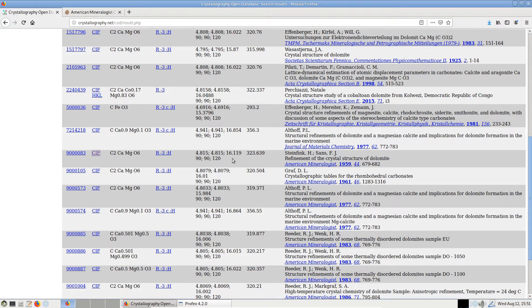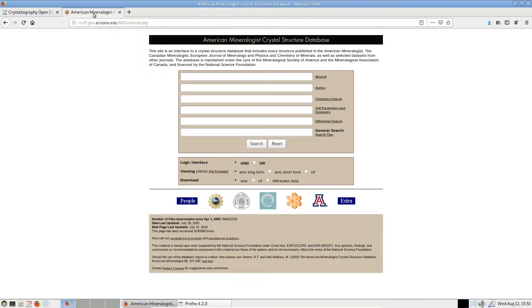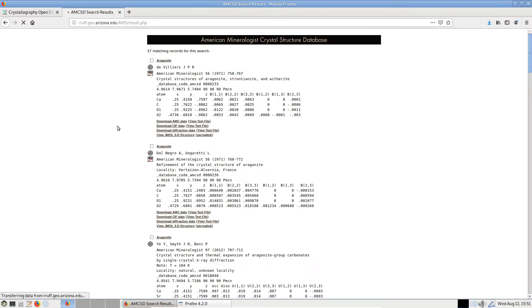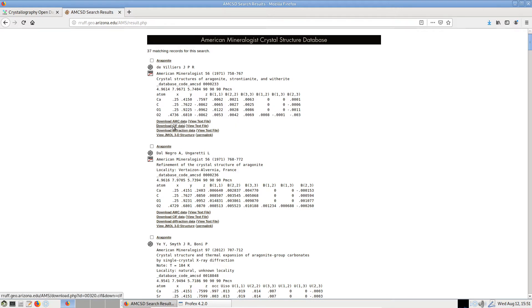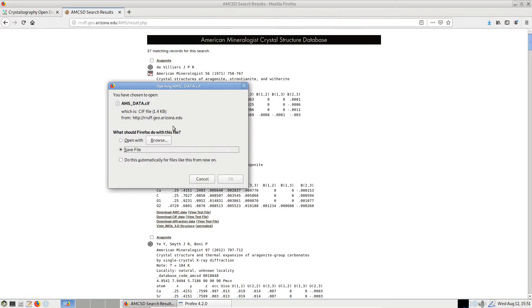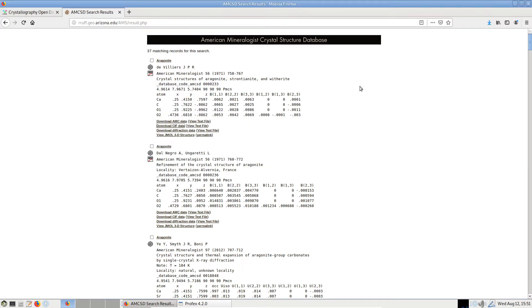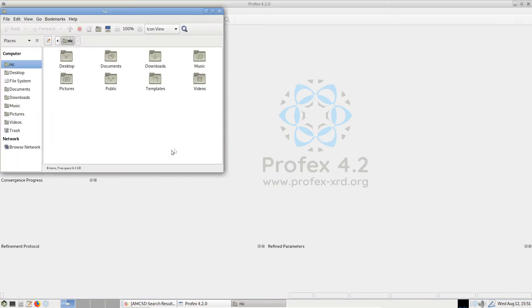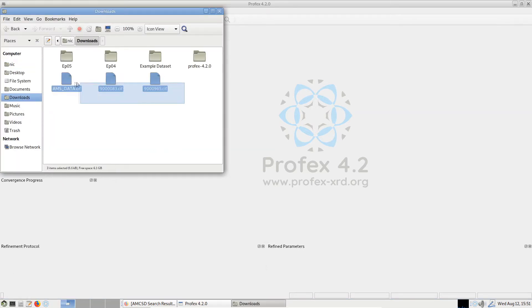Another popular database is from the American Mineralogist journal. We can also get CIF files from here. Let's search for aragonite. Maybe let's just pick the first one. We can download the CIF data. So now let's just put them in a folder. We have three files.